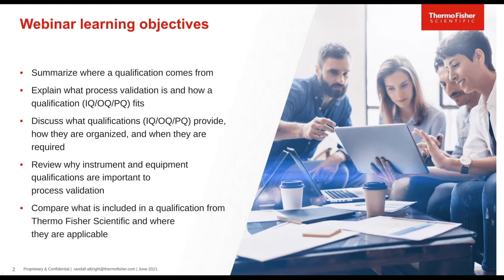Let's quickly review the learning objectives of this webinar. We will learn where a qualification comes from, what process validation is and how qualifications fit, what a Thermo Fisher Scientific qualification provides, how they are organized, IQ, OQ, and PQ, and when qualifications are performed. Finally, why qualifications are important.